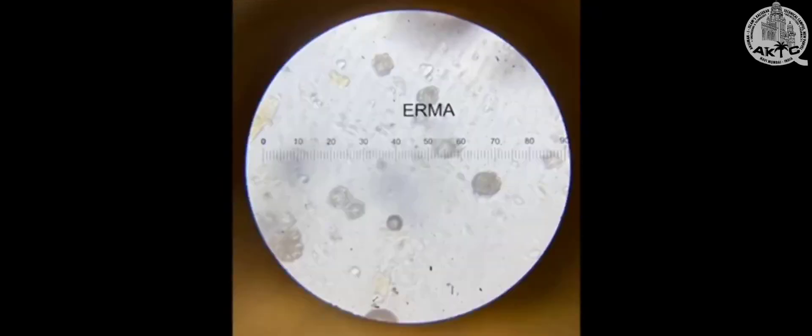Let's begin with the calculation. This is the slide of arjuna, so first we have to check for the calcium oxalate crystals present on the micrometer. The shape of the crystal is spherical and arjuna rosette crystals are present. As you can see, we have to find the diameter of the crystal. The crystal is present between 50 and 60. We have to count the lines and then take that as diameter.